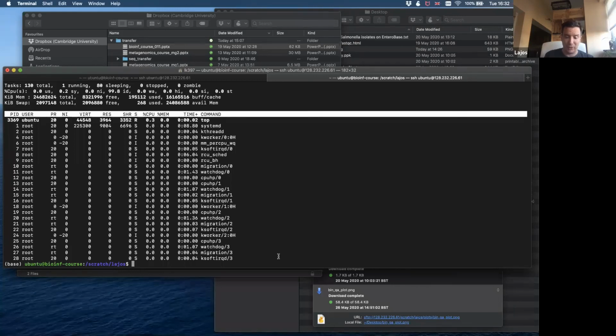So, for example, when we analyzed Claire's fungus genomes, they found some interesting fungus on hedgehogs, and we got back the sequencing data, and we had absolutely no idea what they were. Then we did the de novo genome assembly, but it's also true that they are very simple eukaryotic organisms.